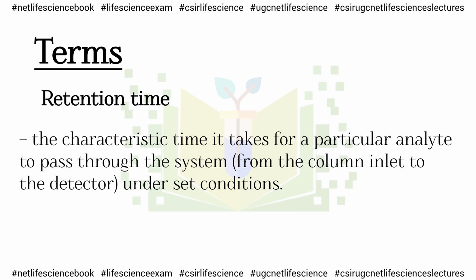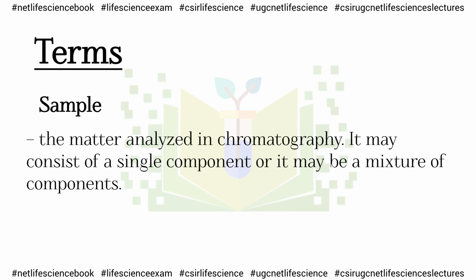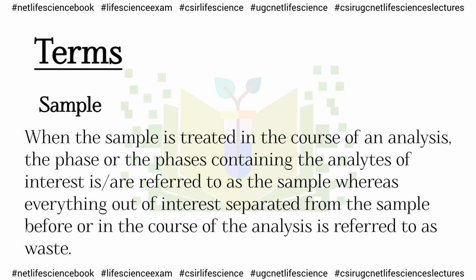Retention time. The characteristic time it takes for a particular analyte to pass through the system under set conditions. Sample. The matter analyzed in chromatography. It may consist of a single component or it may be a mixture of components. When the sample is treated in the course of an analysis, the phase or the phases containing the analytes of interest are referred to as the sample, whereas everything out of interest separated from the sample before or in the course of the analysis is referred to as waste.